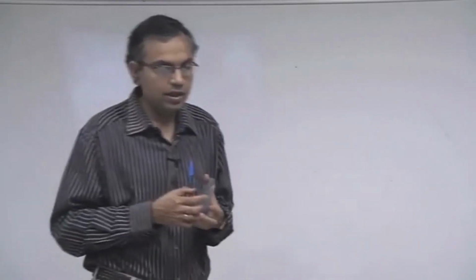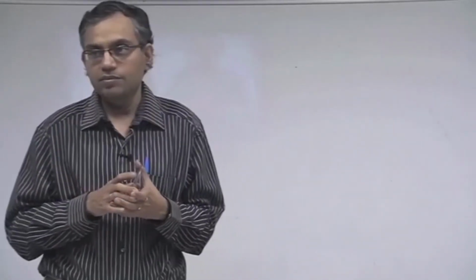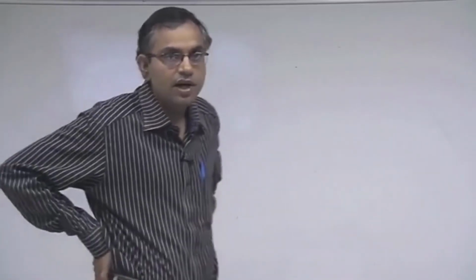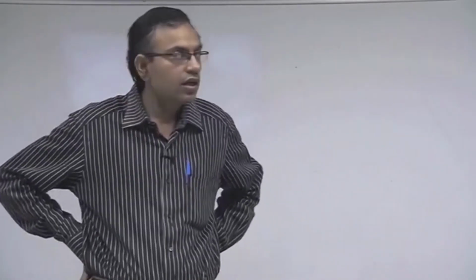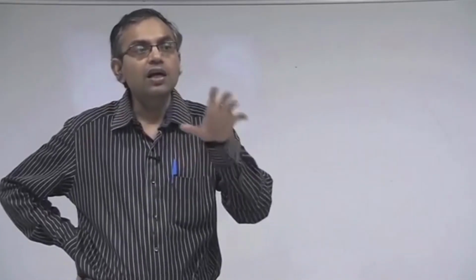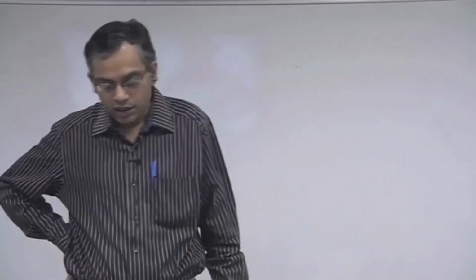So we will try to understand the fundamental science that goes behind this particular technology, and then I will try to demonstrate the fabrication process, maybe through a small video, how these devices are fabricated, and then we will talk about some research issues. It is not that we will be resolving all the research issues, but I will just discuss what are the important research issues that have been going on.